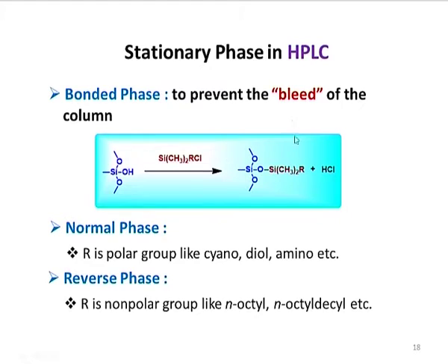Now, one more thing: out of all these siloxane molecules, SiOH molecules, not all are reacted with these silane molecules. Approximately half of them are reacted like that, and the other half react with a normal silane with SiCH3 thrice. So, it means those OH groups are completely sealed, and we call such groups end-capped. So, 50% of the residues would be end-capped and 50% of the residues would be functionalized in an HPLC. That is how the stationary phase is built most generally in HPLC.